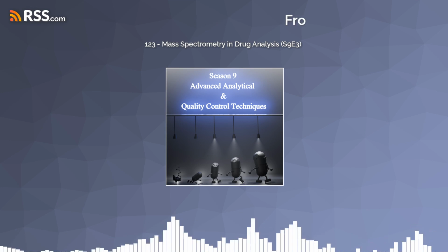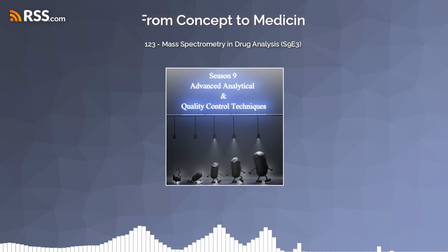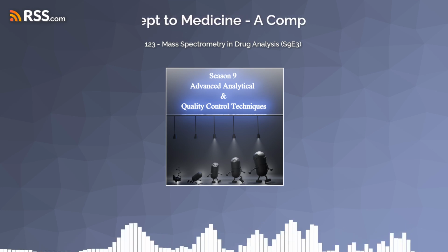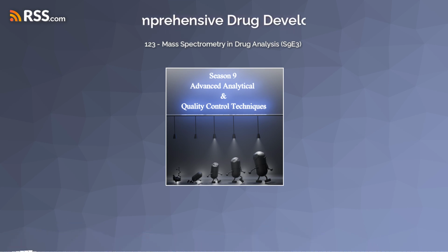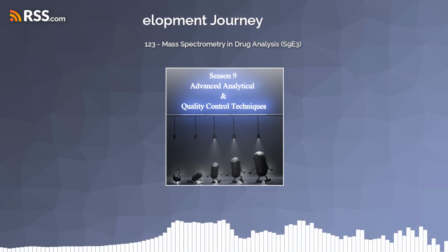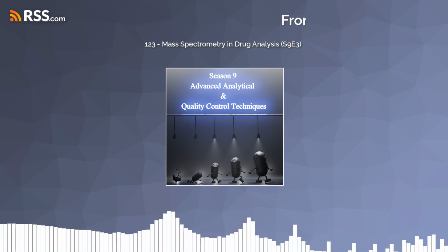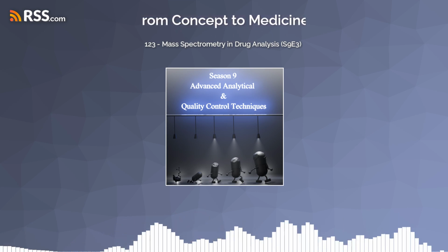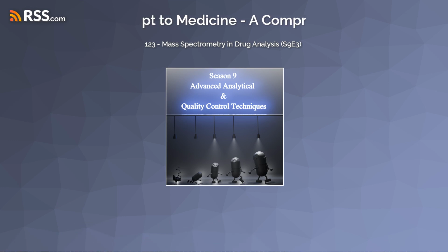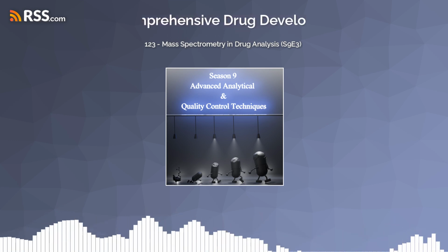Exactly. And then, as each separated component emerges from the LC system, it goes straight into the mass spectrometer. That's where the combined power comes in. So instead of looking at a jumbled mess of molecules, we get each one individually. Makes sense. Right, it's much more manageable. Imagine trying to listen to a room full of people talking all at once, compared to hearing each person speak one at a time. LC acts like that filter. So LC filters it, and the mass spectrometer IDs each molecule. Makes sense for these complex mixtures.